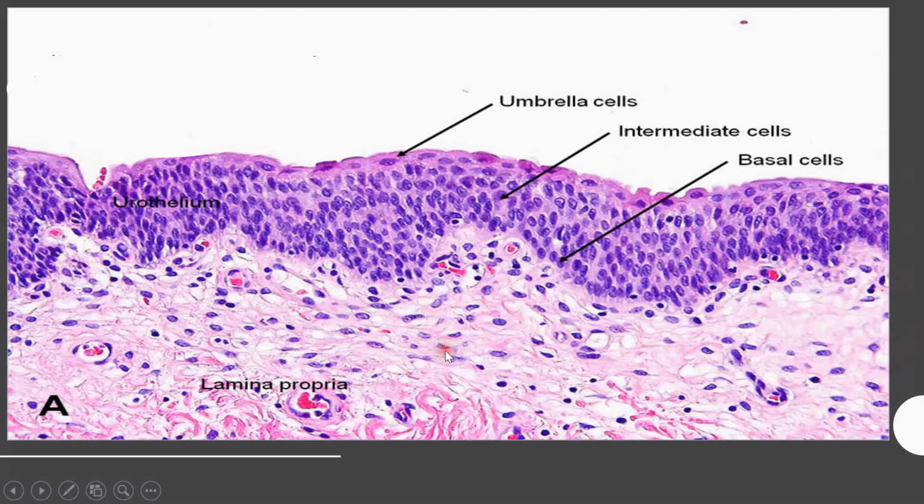This is a microscopic picture of urothelium. Cells of this epithelium are organized as three layers: a single layer of small basal cells resting on a very thin basement membrane, an intermediate region containing from 1 to several layers of more columnar cells, and a superficial layer of very large bulbous cells called umbrella cells that are occasionally bi or multinucleated and are highly differentiated to protect underlying cells against the cytotoxic effects of hypertonic urine.